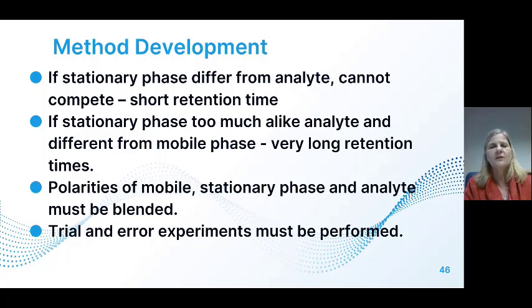So you would maybe start with a program of an hour to just see how many compounds you have and how long it takes for your compounds to elute. And then you would start playing around by increasing your acetonitrile, maybe making it much higher, so that you can get the compounds eluted that are strongly attracted to the non-polar stationary phase.